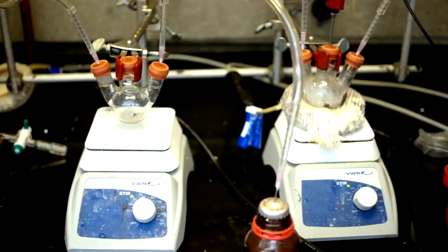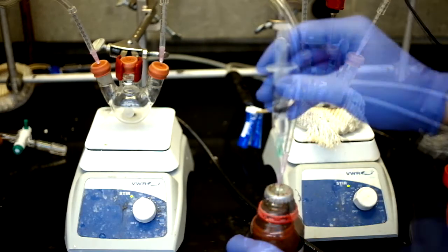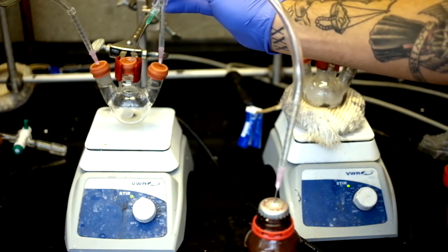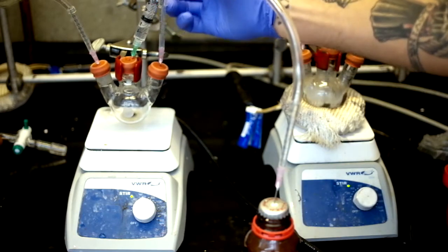First we need to put argon into the diethyl zinc flask. We can then inject 1.3 milliliters of diethyl zinc into the tellurium precursor and let mix for about 10 seconds.